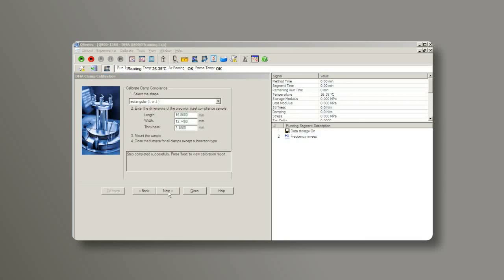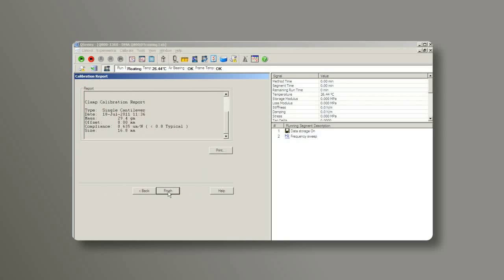After the calibration, click on next and check the report. Make sure the compliance value is lower than the maximum value which is shown on the right side of the screen. Now you have finished the single cantilever clamp calibration.